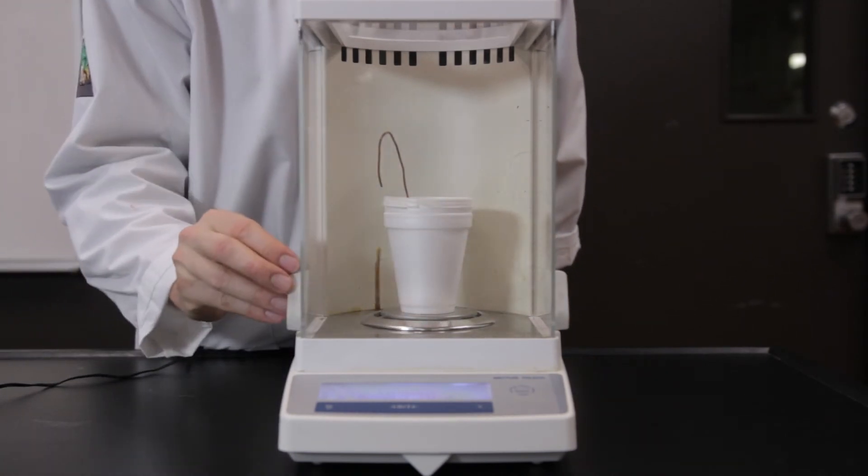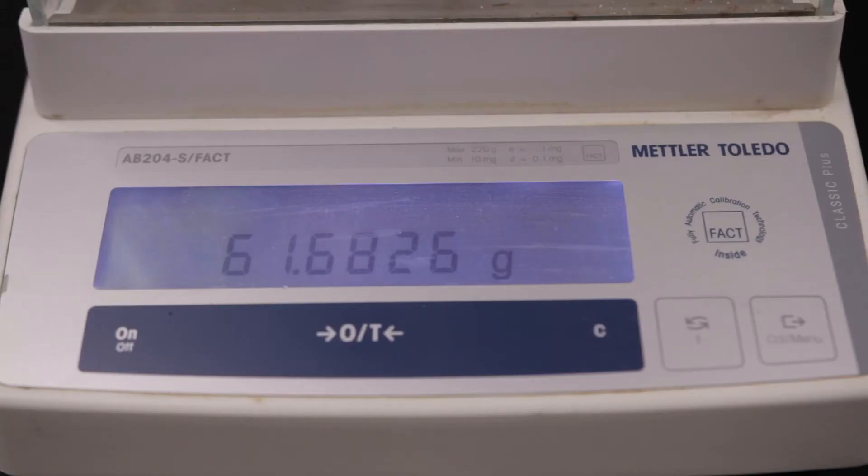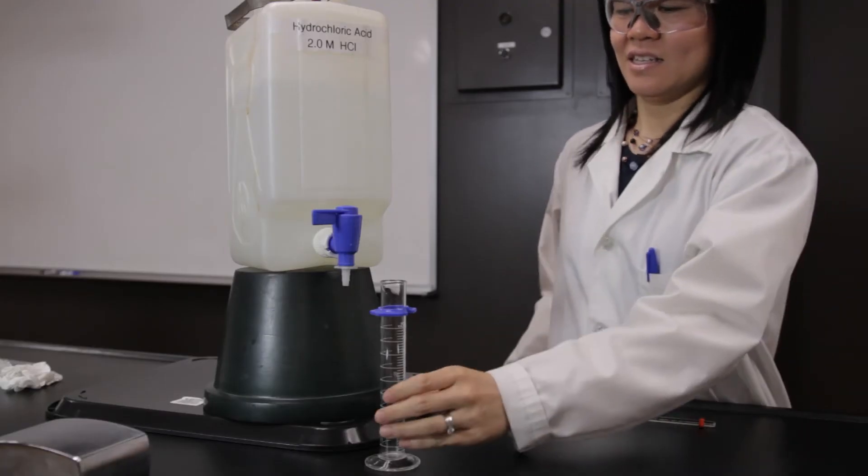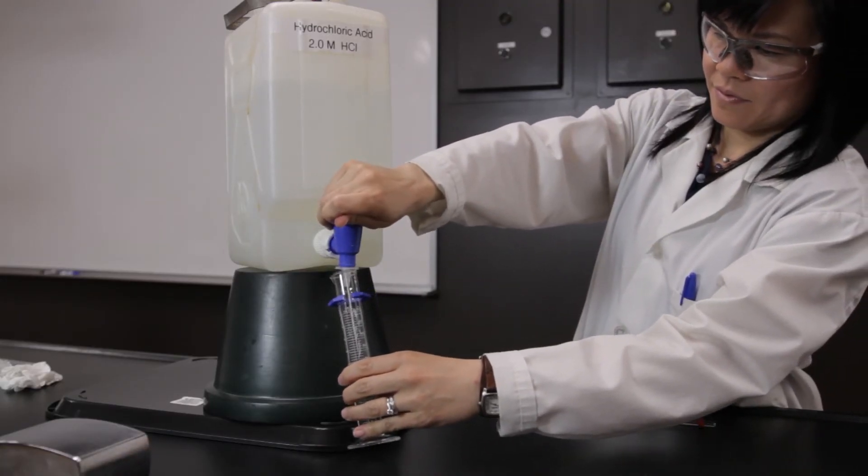Record the exact mass. Do not discard the contents of the calorimeter as it will be used in part 2. Obtain 50 milliliters of hydrochloric acid solution using a graduated cylinder.